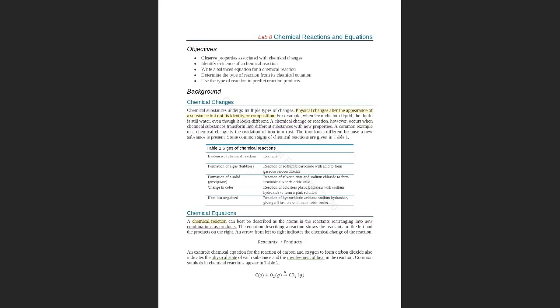As we said at the beginning, the main objective is to observe. Because you are not in the lab and we are doing this experiment virtually, the way we are doing it here is by observing some pictures before the chemical reaction took place, and after the reaction took place.